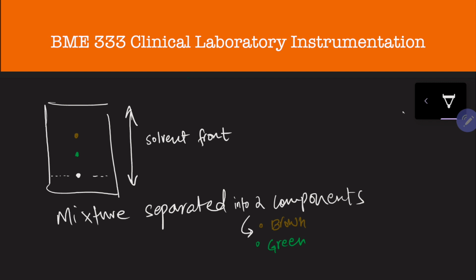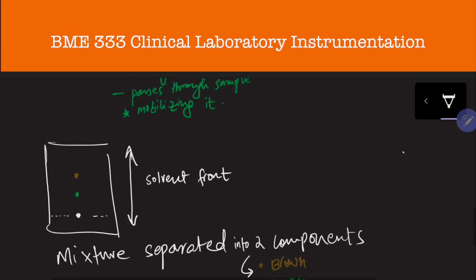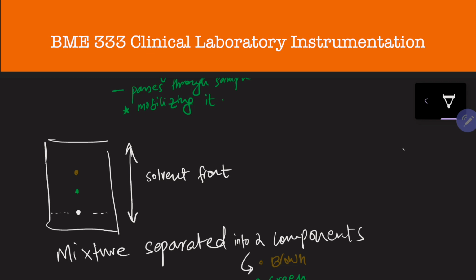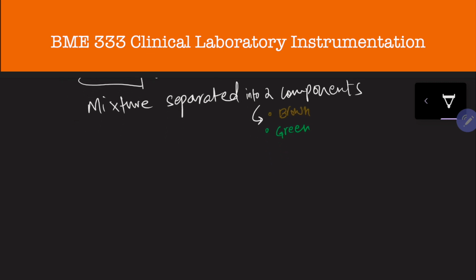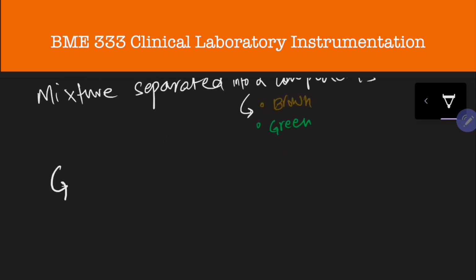The next up is gas chromatography. Gas chromatography, on the other hand, does not use a plate. As is evident from the name, the mobile phase in gas chromatography is a gas, but let's talk about the structure a bit. It uses a metal tube that houses or packs the stationary phase.